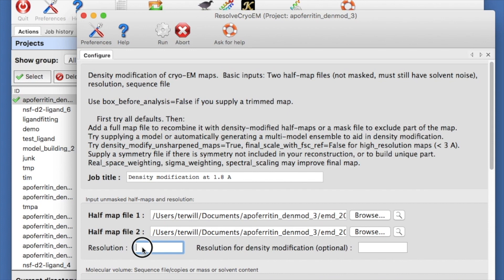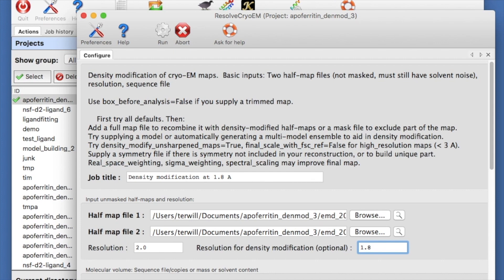The resolution of our map is about 2 angstroms. The best value of the resolution for density modification is usually a little smaller than the map resolution. We could leave it blank, but let's specify it as 1.8 angstroms.